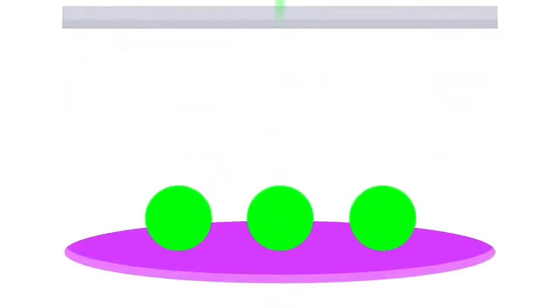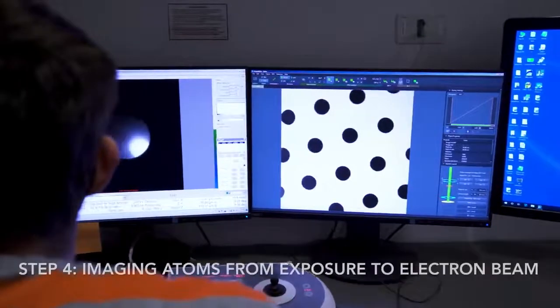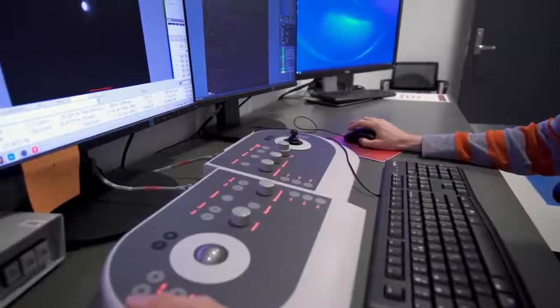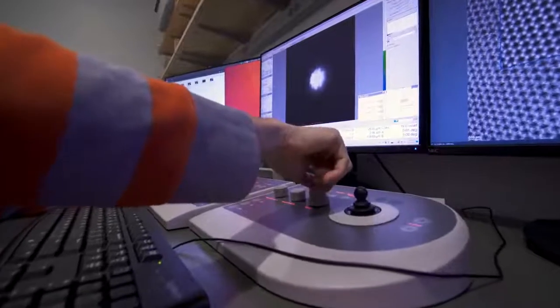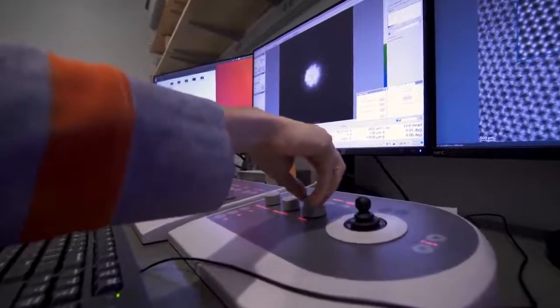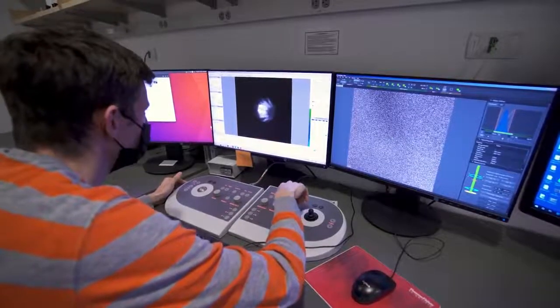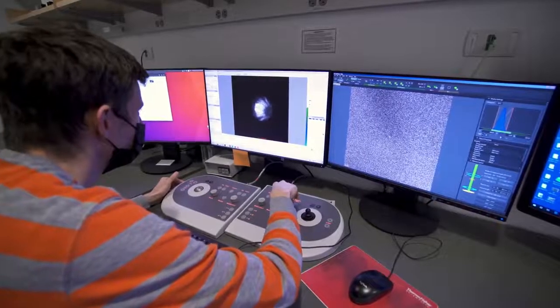As the focused beam scans over the sample, electrons travel through it and are displaced by atoms and scatter. The scattered electrons are collected by the electron detector, which then assigns a grayscale value to form the image. In the control room, you can zoom and focus on particular parts of the sample to identify atom activity and collect data. The more electrons that are collected, the brighter the image. Where there are no electrons, the image is dark.